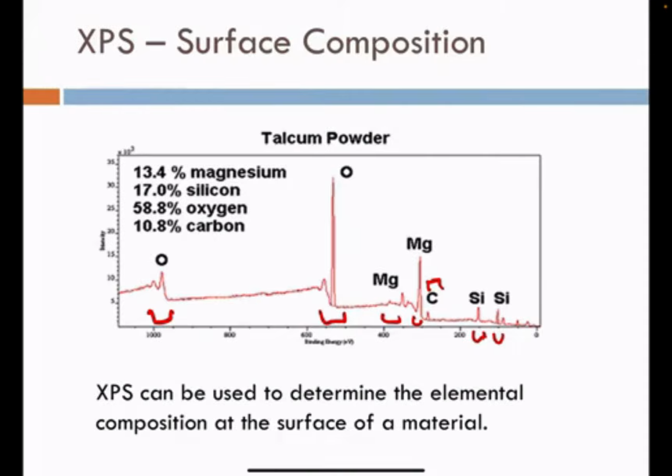Carbon accounts for around 11%, and oxygen is about sixfold the carbon, 58.8% of oxygen.